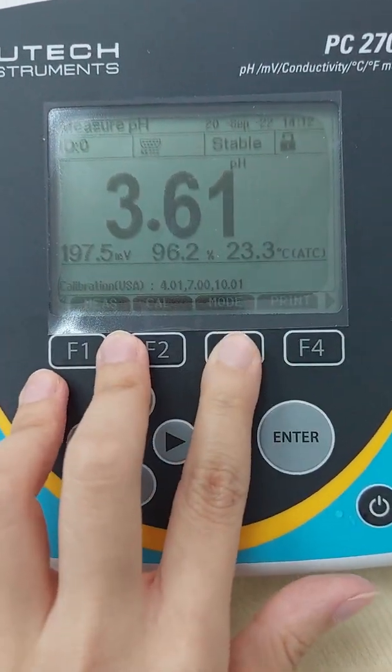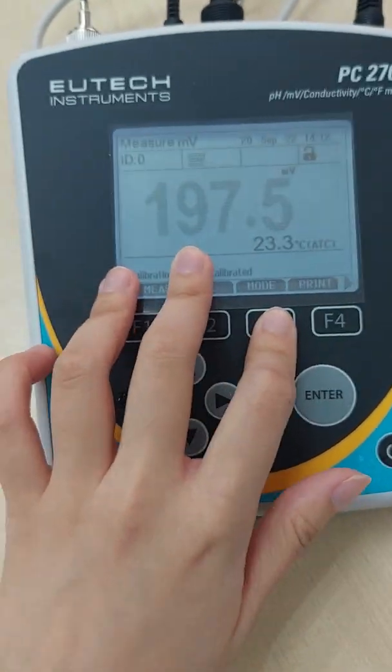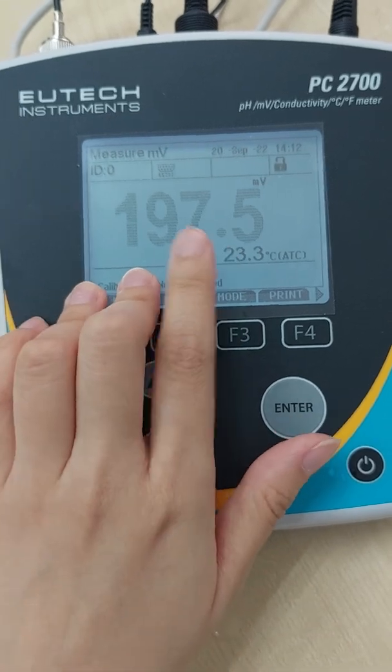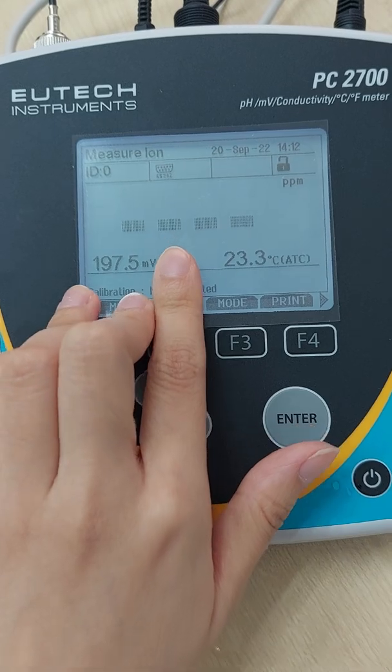And then we press mode. We're going to millivolt. So here, millivolt is using the same probe as the pH probe. Mode again, there will be ion.